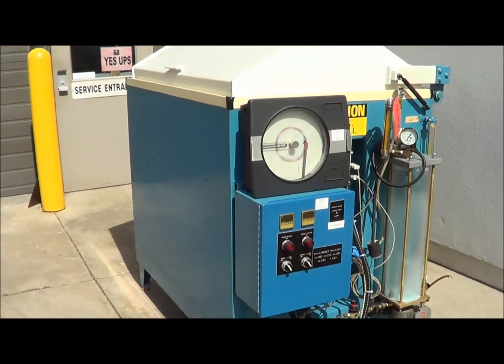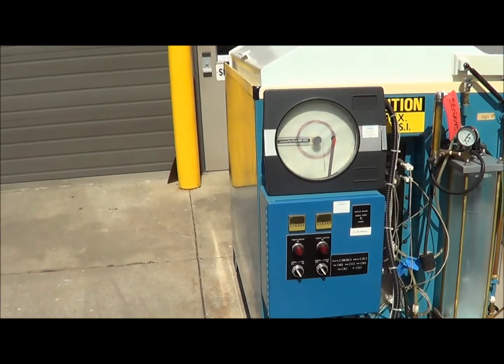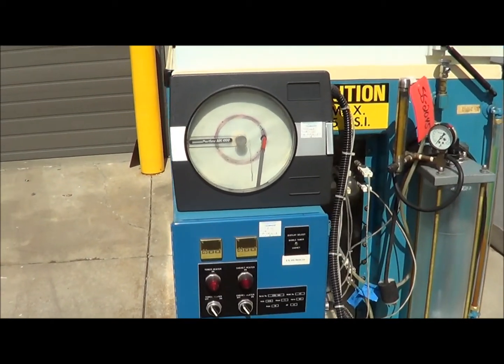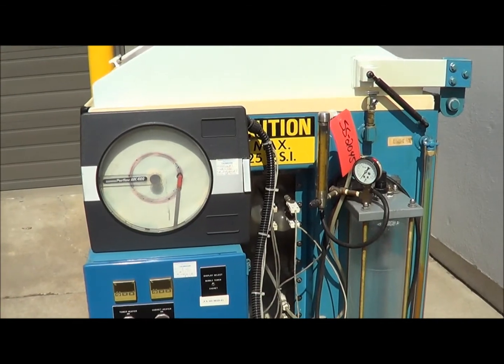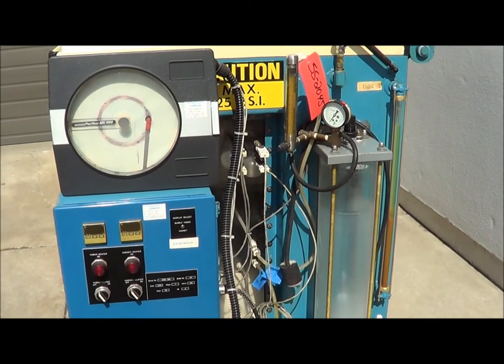This is a 30 cubic foot unit. On the side here you can see the controls, it has digital Omron temperature controls as well as a chart plotter.